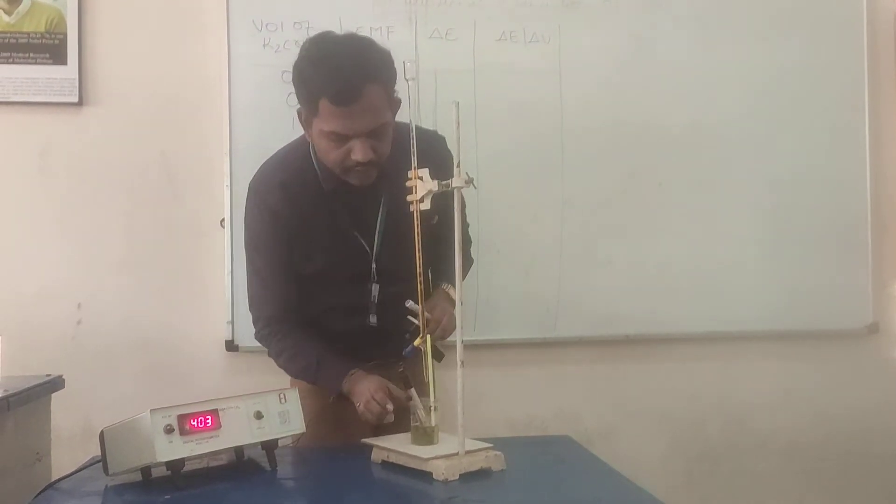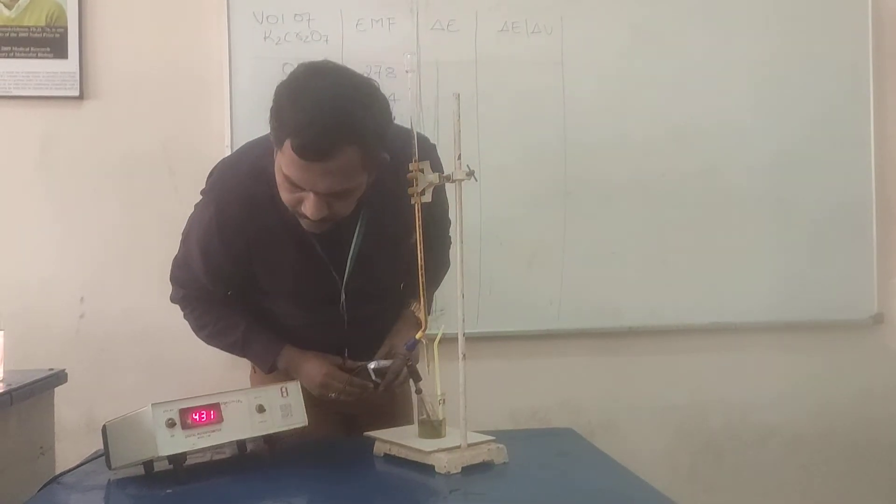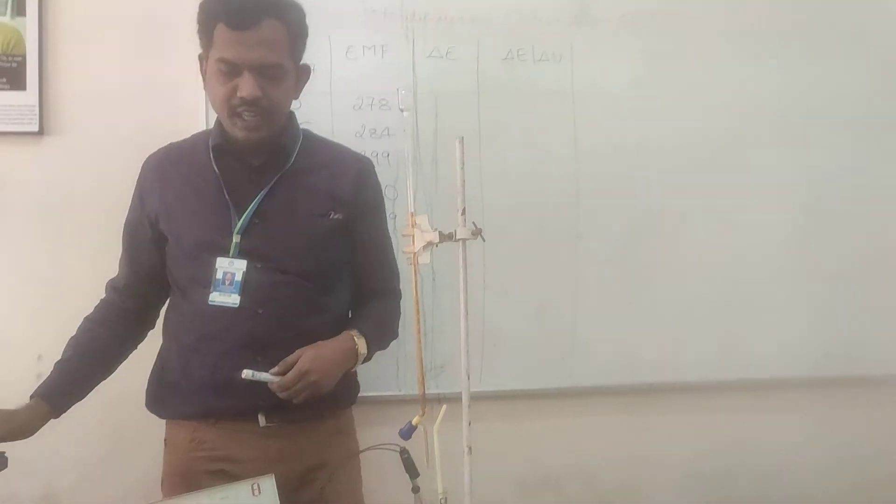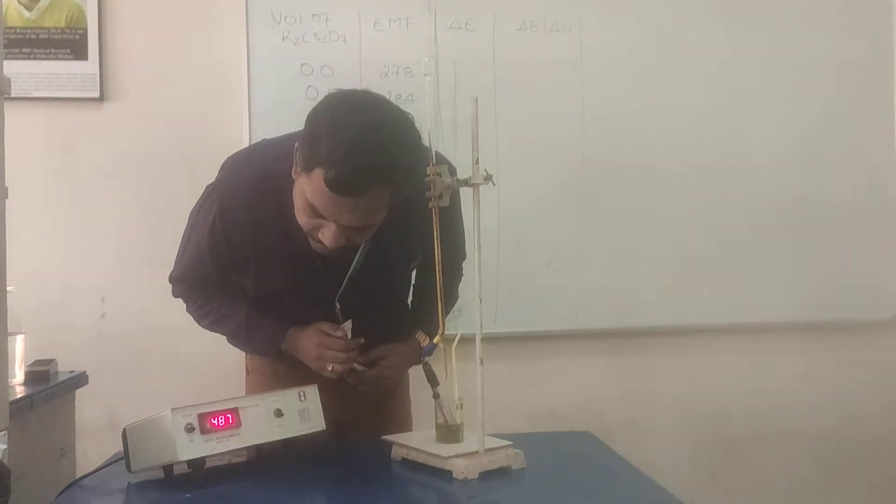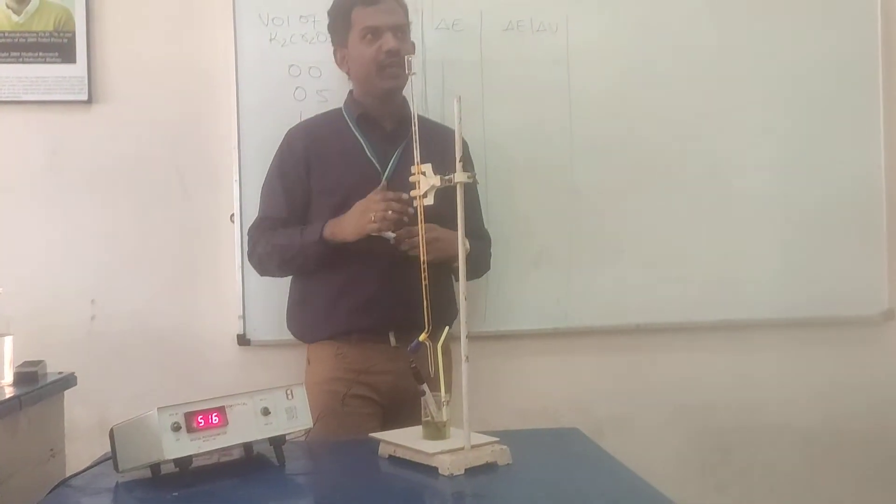It is increasing, you can see the EMF is continuously increasing. We had around 380... Now, it became 483, 490. So, it is increasing. There is a sudden jumping potential.